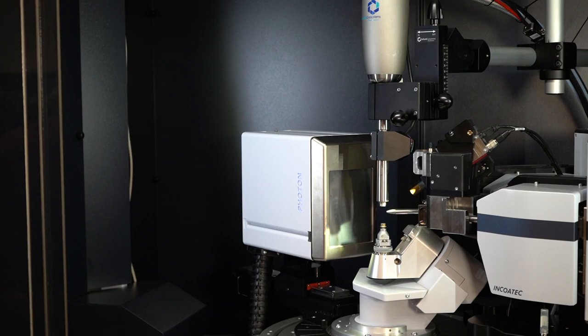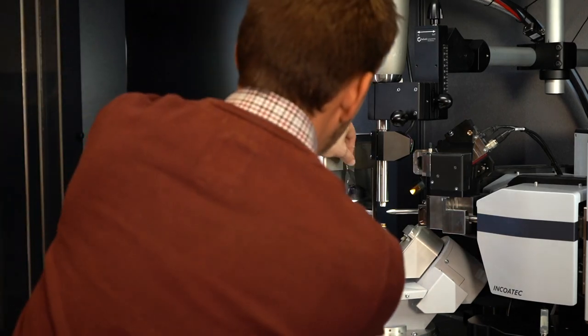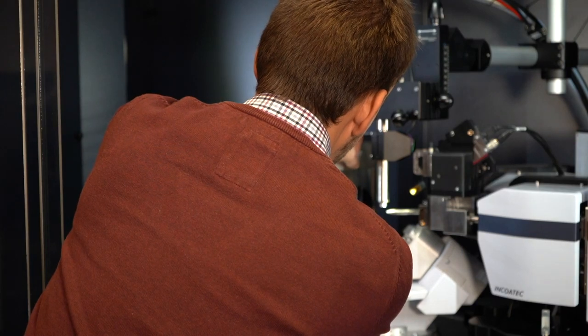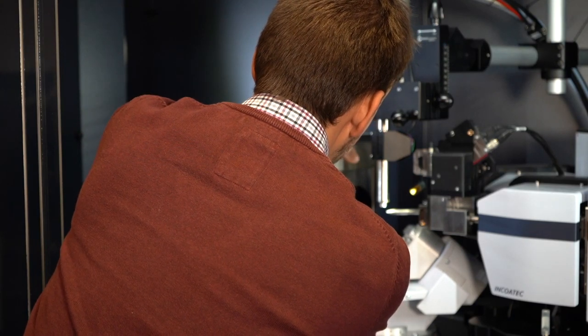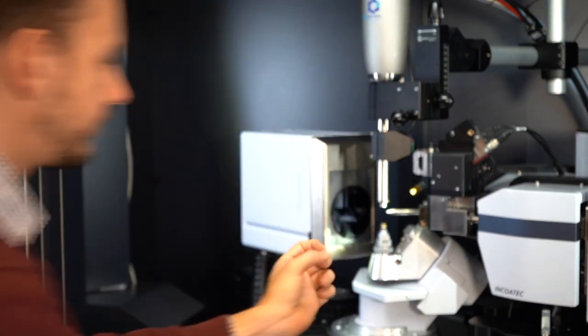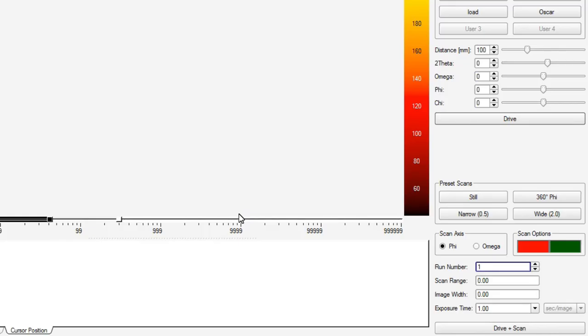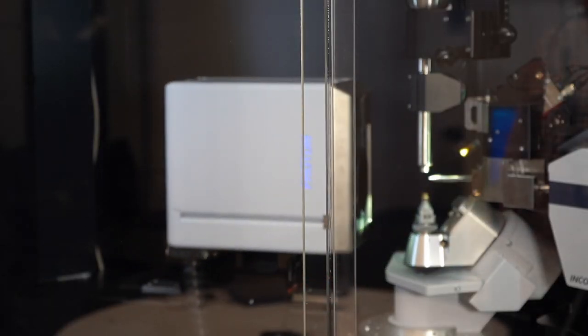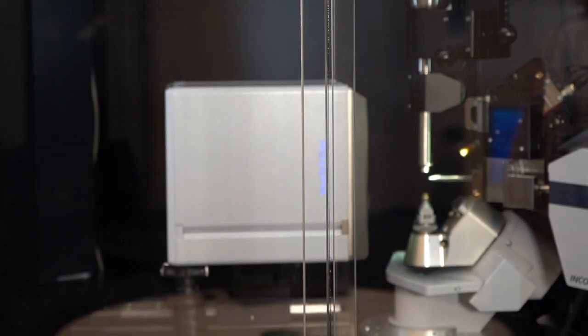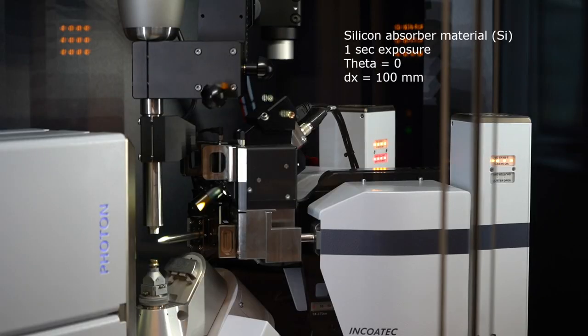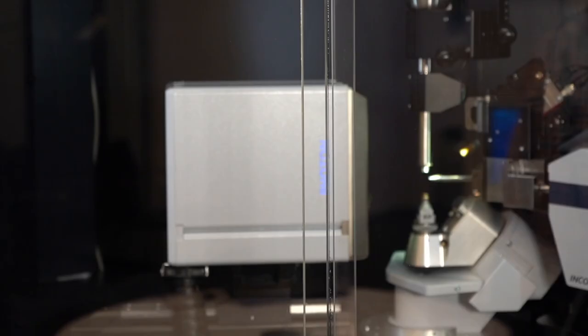So for the next shot I will mount the silicon wafer now in front of the detector.